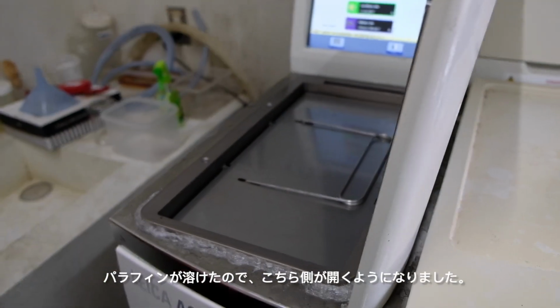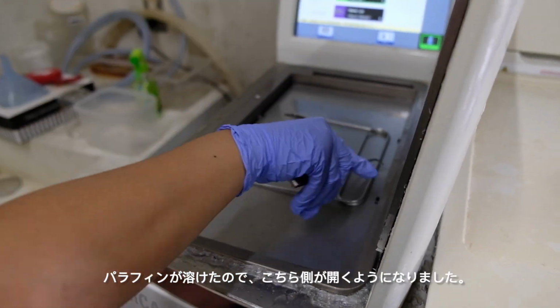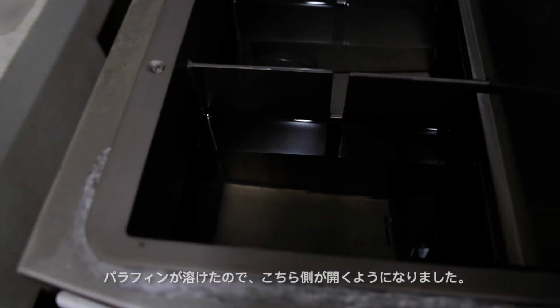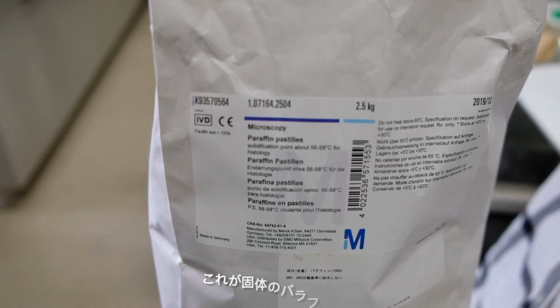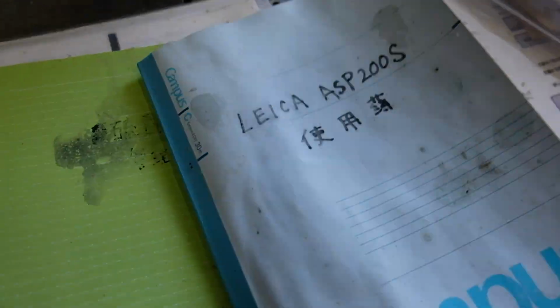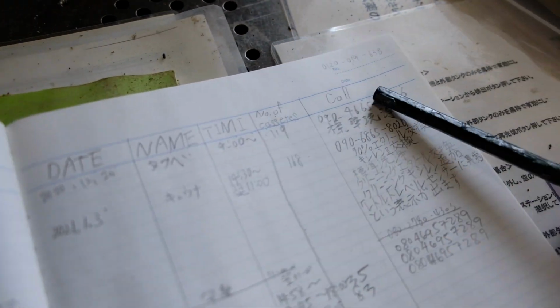Here we can see that we can open this side up, and we will show that the inside paraffin is now liquid. And this is the solidified paraffin. Whenever you use the machine, don't forget to record your usage in the lab book.